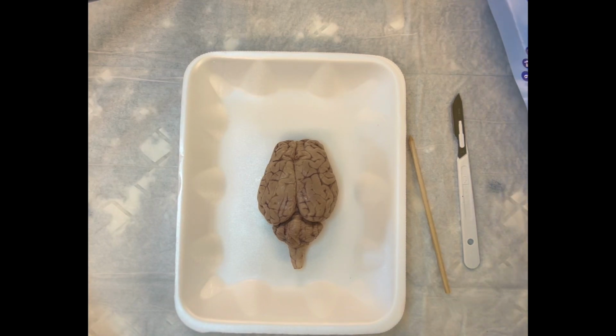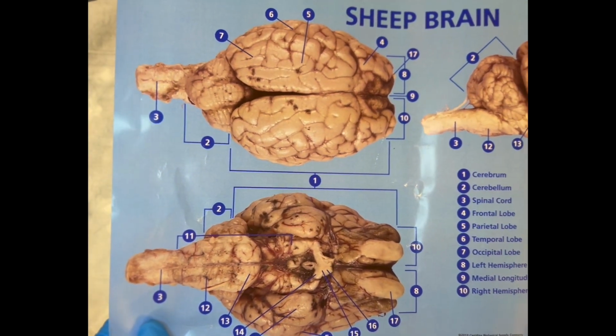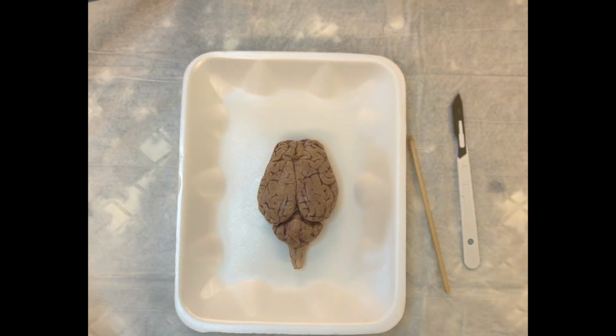It would be a good idea to have the dissection map provided by the Carolina Distance Learning Lab Kit. That's a great guide for you. But I am going to go through and identify and talk about the main features and structures that I want you to be able to recognize. It's a great idea to be looking at the diagrams from the central nervous system chapter, looking at those brain images, and you want to be noticing a lot of these correlations.